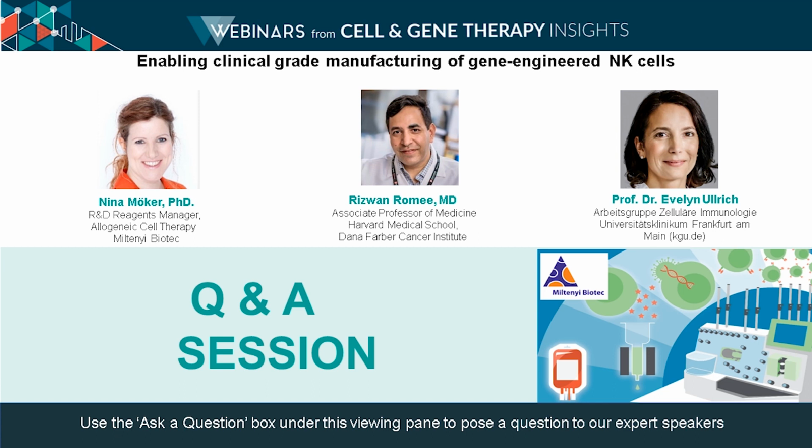Every time a product is released, we take some cells at different time points, actually right before they infuse the patient, but also prior, as Nina showed, at every point basically you can take some cells and analyze them. But that again is cumbersome and it delays things. And we use the markers she mentioned, we use the viability, we use things like that.